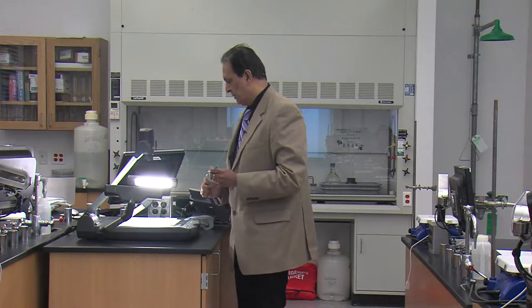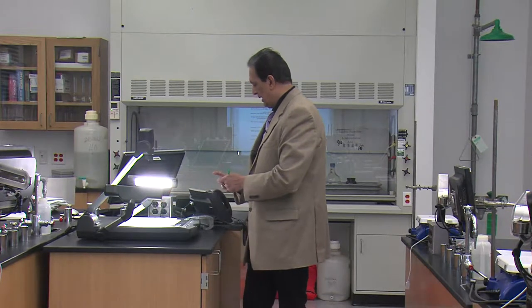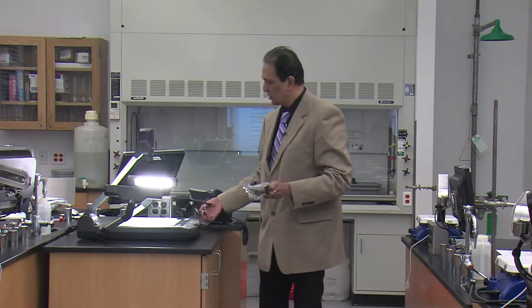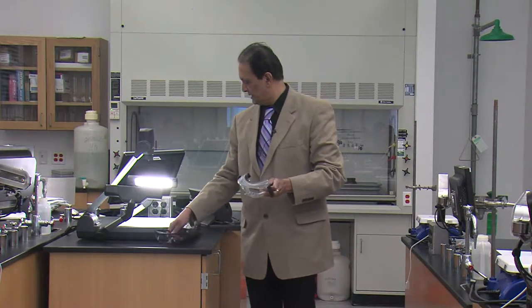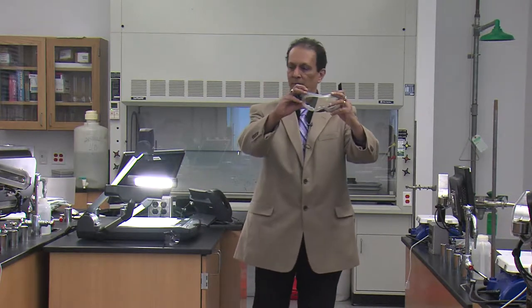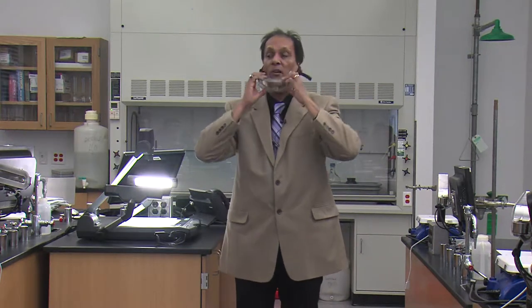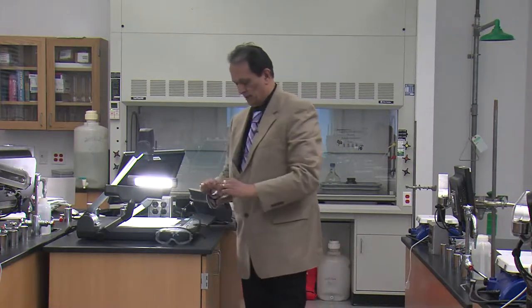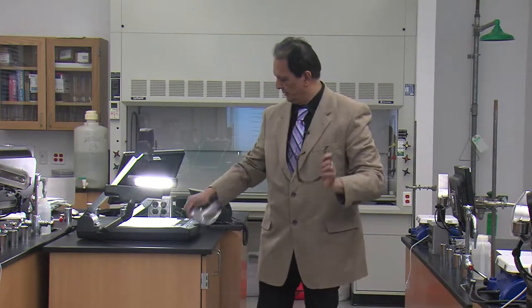Eye protection must be worn at all times, number six. There are two types of eye protection we have, and these are OSHA approved, okay. People who are wearing prescription glasses have no choice but to wear them, all right? And these should be worn over your eyes at all times, not like this, or not protecting your chin, okay? Same goes with this. Now, people who are not wearing any glasses have a choice. They can wear either of these.